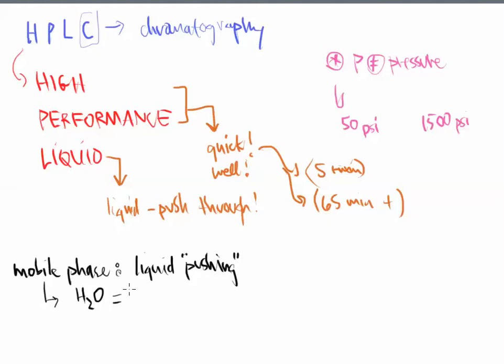Yeah, if you don't believe me, take a look at the safety data sheet for water, and that's what they're called now, safety data sheets, SDSs, no longer MSDS. They took the M off of it. If you look at the material safety data sheet or safety data sheet for water, it's going to say in large quantities it can kill. Well, you reckon? I guess it would. Anything probably in large quantities is going to kill. But water is one of the mobile phases that we can use for HPLC.